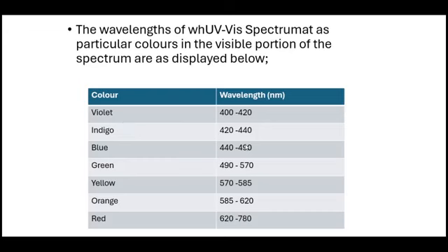The wavelength is represented with different colors.